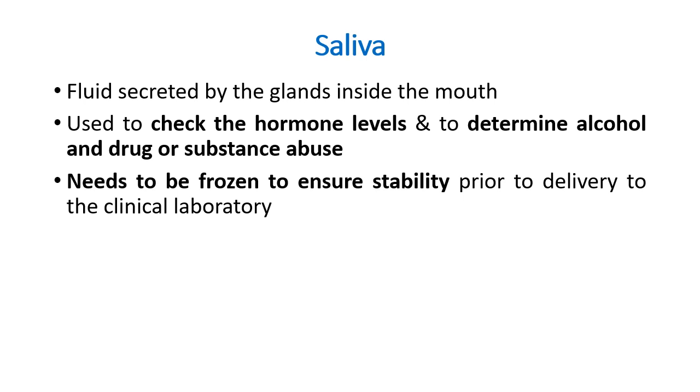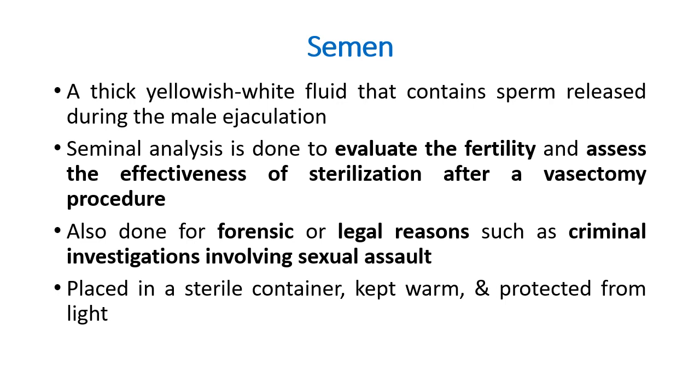Saliva. So it is used to check the hormone levels, determine alcohol, and drug or substance abuse. So dapat siya ay frozen to ensure stability prior to delivery sa clinical laboratory. We have semen. It is a thick yellowish white fluid that contains sperm released during ejaculation.